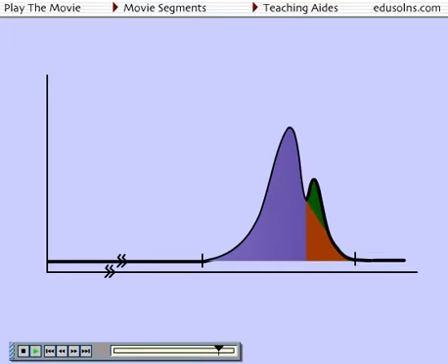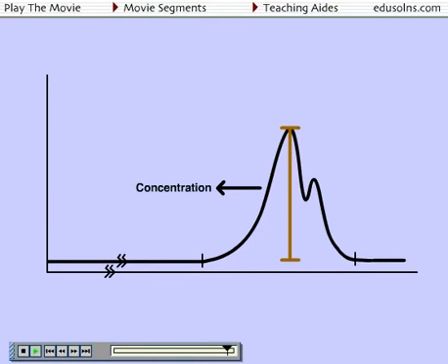Since we relate peak area to concentration, the integration method used will greatly affect the calculated concentration. Another option is to use the peak height method, but this is also the subject of each of the concerns mentioned earlier.